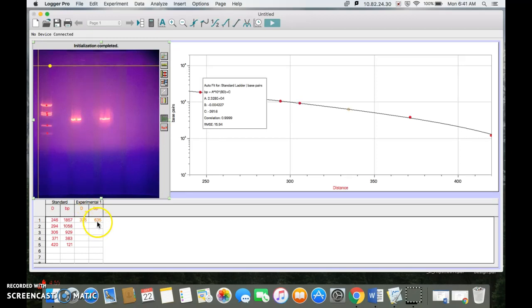that is 635 base pairs long, which is pretty accurate from what I'm looking for. This band should be about 620 base pairs, so it's a little off, but it's really, really close. I could say with some certainty that that's what I want that band to be.